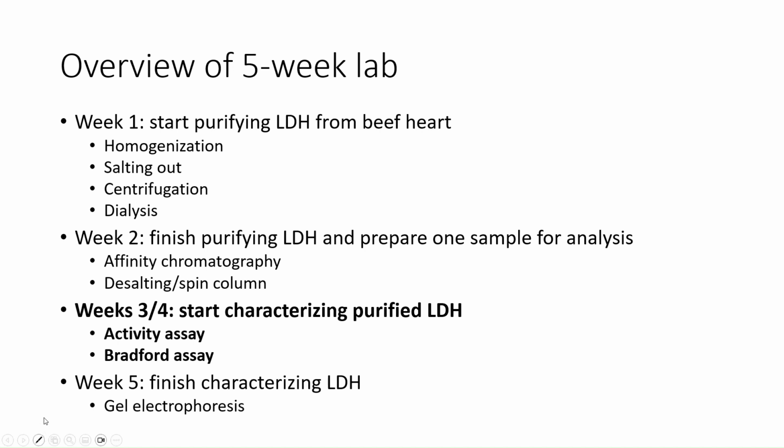So for this week and next week, for the next couple of weeks, we are going to start characterizing our purified LDH. We'll do that using two assays, an activity assay and the Bradford assay. And then finally in week 5, we'll finish up characterizing our LDH by running gel electrophoresis to visualize the proteins that we have in our sample.